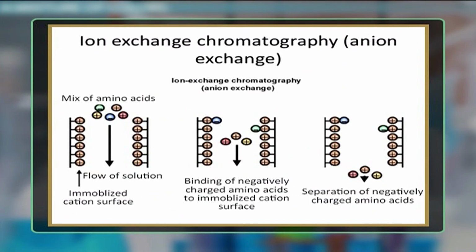When this technique was initially developed, it was primarily used for water treatment. Since 1935, ion exchange chromatography rapidly became one of the most heavily leveraged techniques, with its principles often being applied to the majority of fields of chemistry, including distillation, adsorption and filtration.